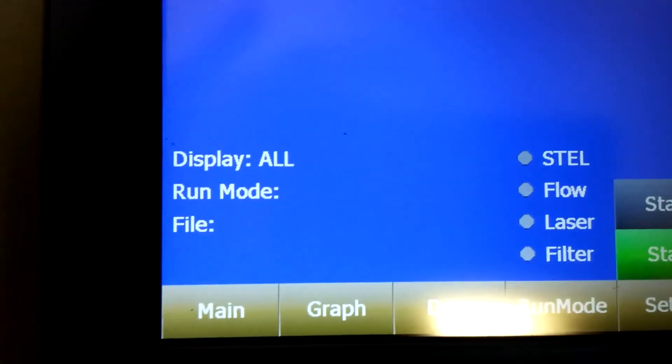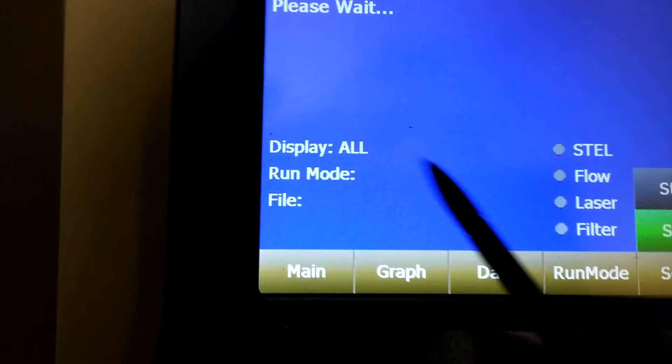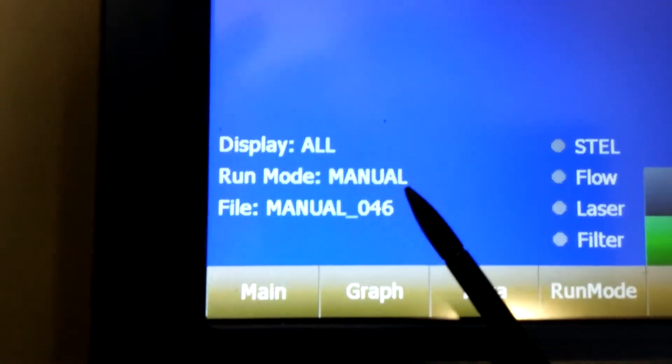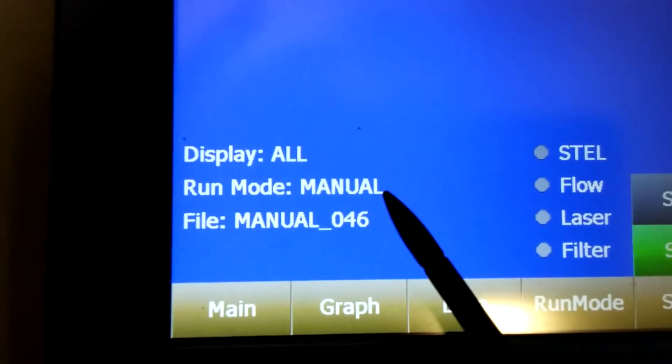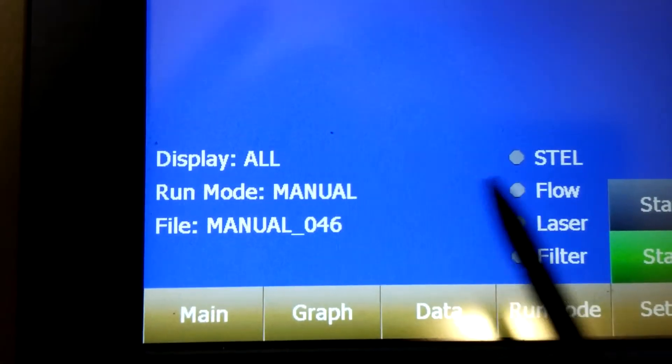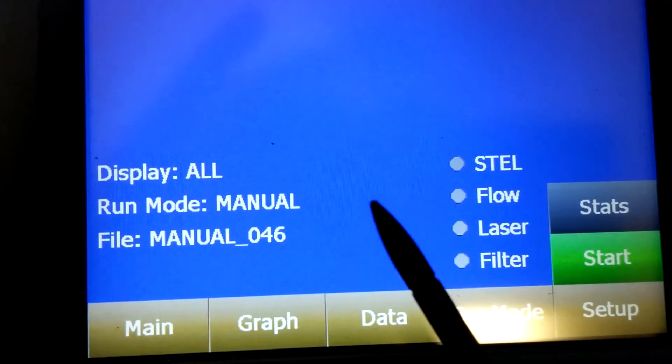You will see right here, run mode is manual, which is what you wanted, so that you can manually stop and start. You don't have to have it pre-programmed using the computer.